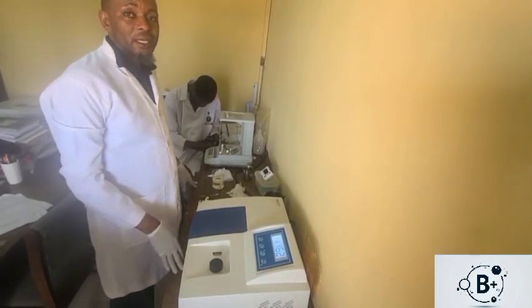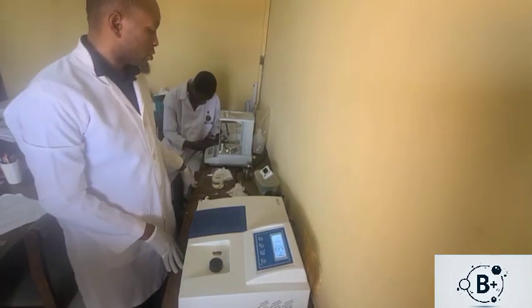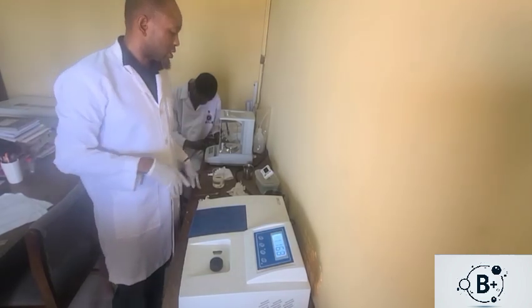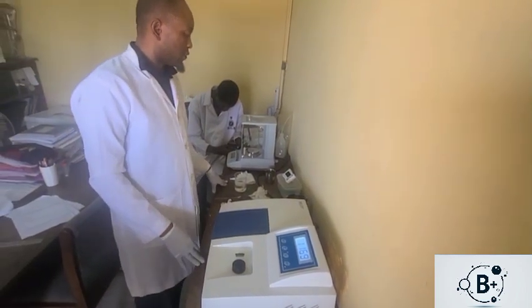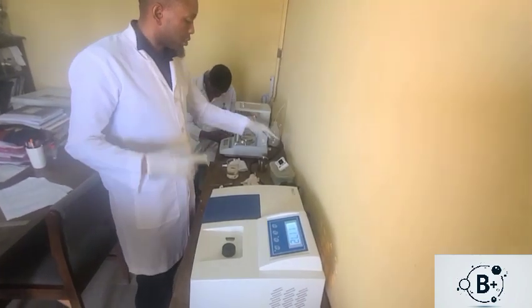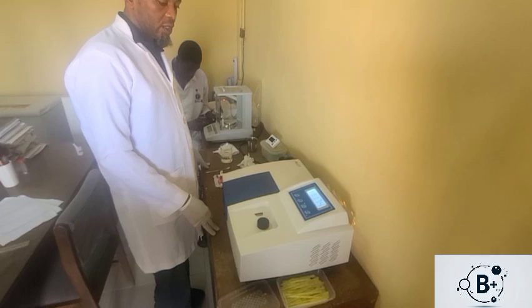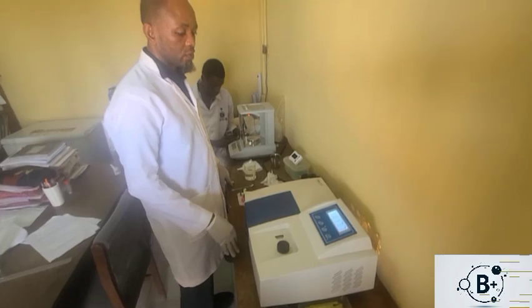So we are checking the absorbance at 60 second intervals. So we have 0 to 60 seconds, from 60 seconds to 120, from 120 to 180. So our calculation will be based on the difference between the initial reading and the final reading. So we are now on the last one. There's still increment, right? Okay.